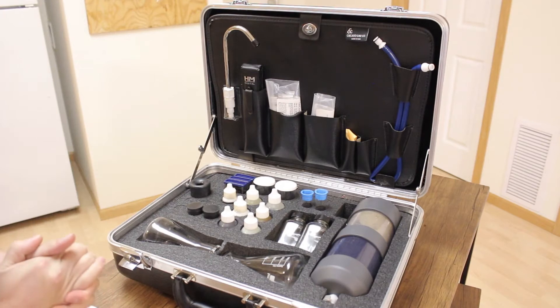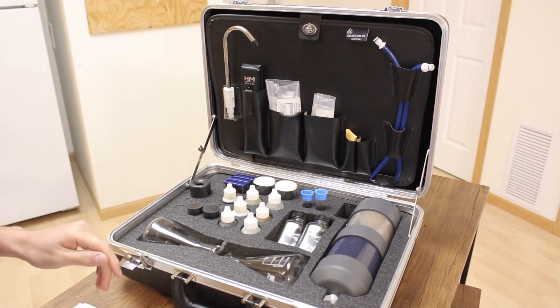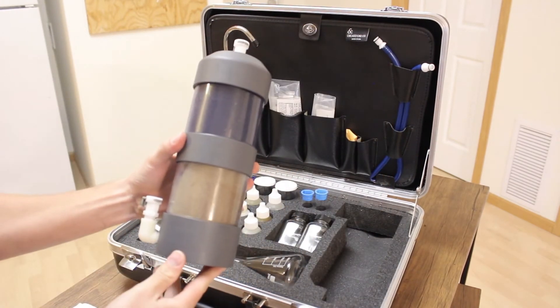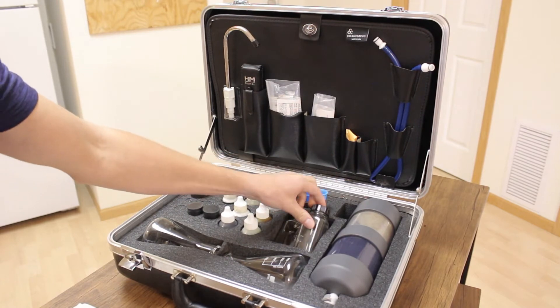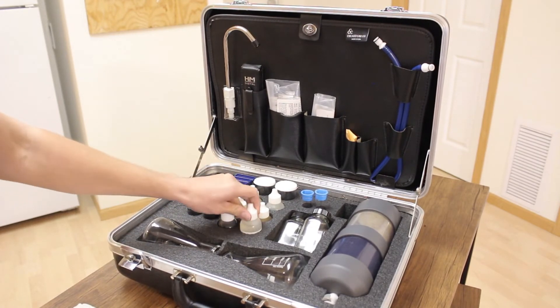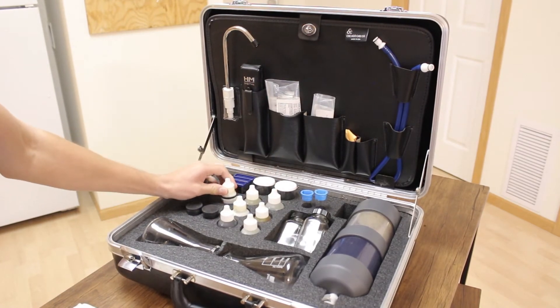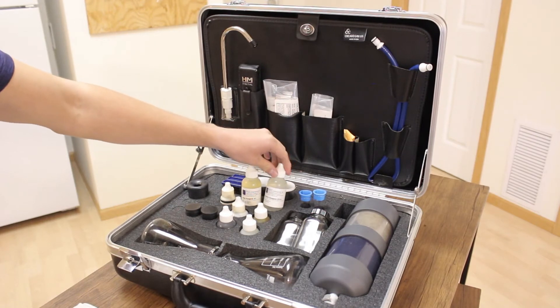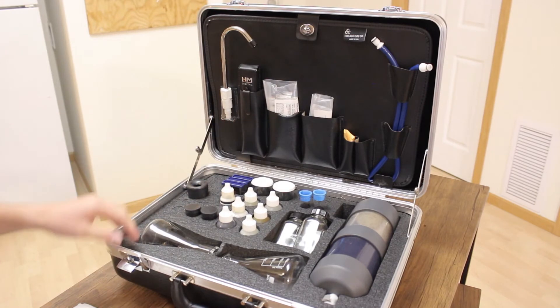It looks pretty similar to what you might have seen on the inside, with some key differences. The platinum actually comes with the iron and nitrate test — everything you see here comes with the platinum case. This mini softener has carbon and resin inside and just comes with it. You get these nice glass mixing bottles and your soap flasks. The chemicals included right off the bat are the hardness indicators one and two, the precipitation reagents one and two, the pH indicator, the soap reagent one, and the chlorine reagent. It comes with everything so you don't need to purchase anything extra, as well as all the little tools for testing.